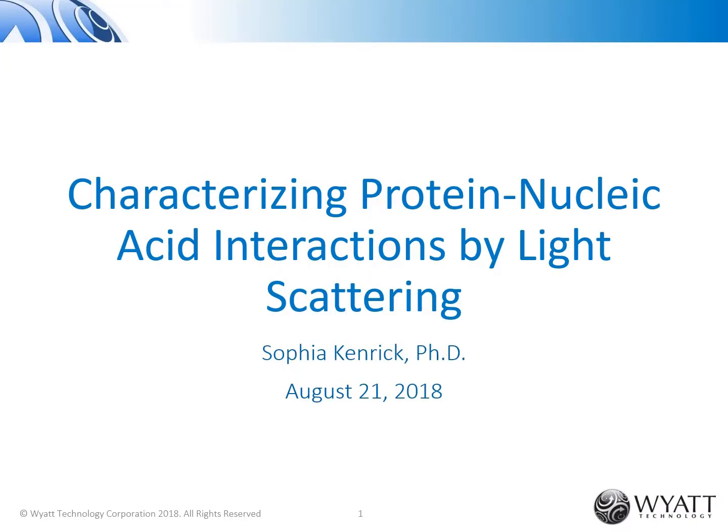Thanks so much for the introduction. In today's webinar, I'll be highlighting characterization tools for analyzing nucleic acids and the interactions between nucleic acids and proteins using light scattering. So we'll start off with an introduction to multi-angle light scattering, and then I'm going to present two case studies that show the interactions between DNA and their protein ligands.